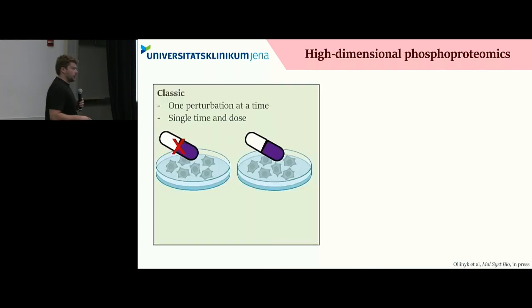Another area of implementation is high-dimensional phosphoproteomics, to take full advantage of the throughput and sensitivity, because usually phosphoproteomic approaches take one perturbation at a time, single dose, single time point, and compare them, a control versus treatment, let's say.